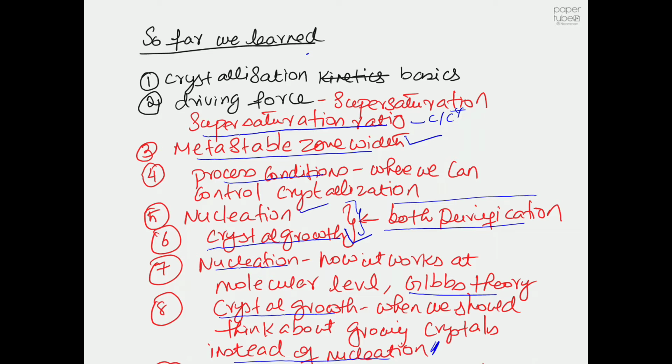So you don't have to predict anything. There are a few techniques that allow you to get some rough idea about the crystal population. We call them the population balance model. But okay, for this module we don't have to worry about that. But keep this in mind: whenever I say, or industry people say, controlled crystallization, it means they can control the crystal attributes. One is the size, the shape. Apart from that, they can also have some information about the number of particles in the crystallizer.